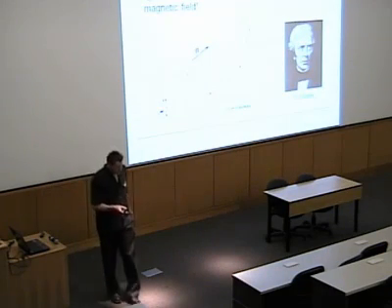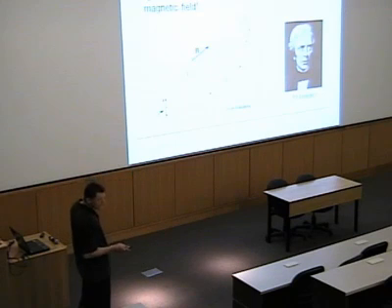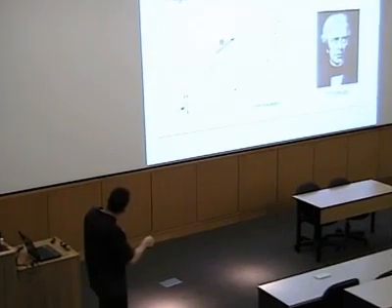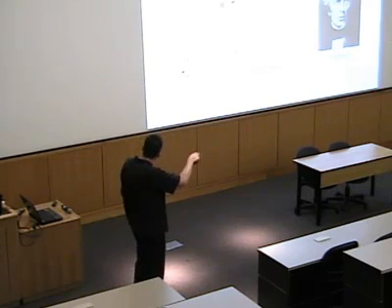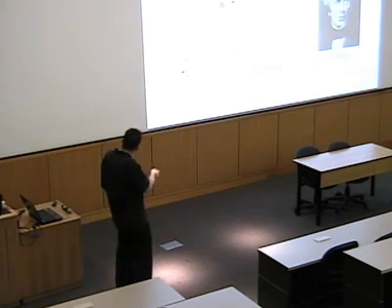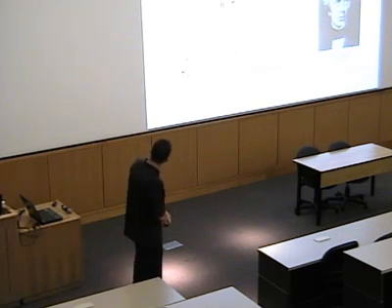The whole thing goes way back into the 1800s to Michael Faraday, who discovered the so-called magneto-optical effect. If we take linear polarized light, indicated here, this is the electric field vector of our light wave, and it oscillates in this plane. We shine this through a medium and apply a longitudinal magnetic field. You can see the magnetic field lines are parallel to the direction of propagation of the light. You turn on the magnetic field, and you can see that the direction of the linear polarized light rotates. The angle rotates a little bit, and that's the magneto-optical effect.